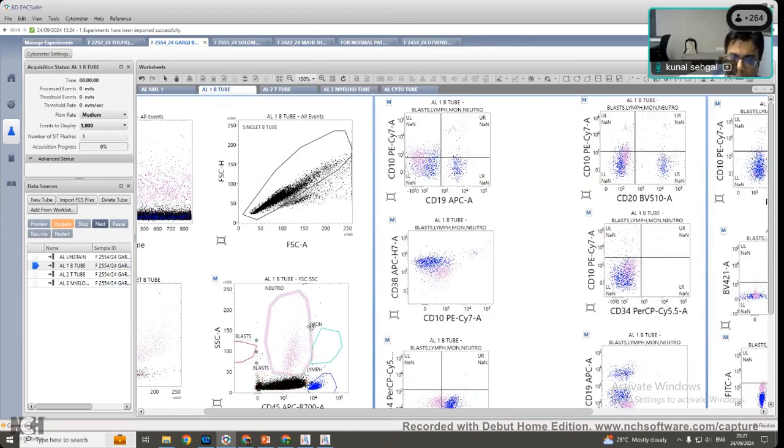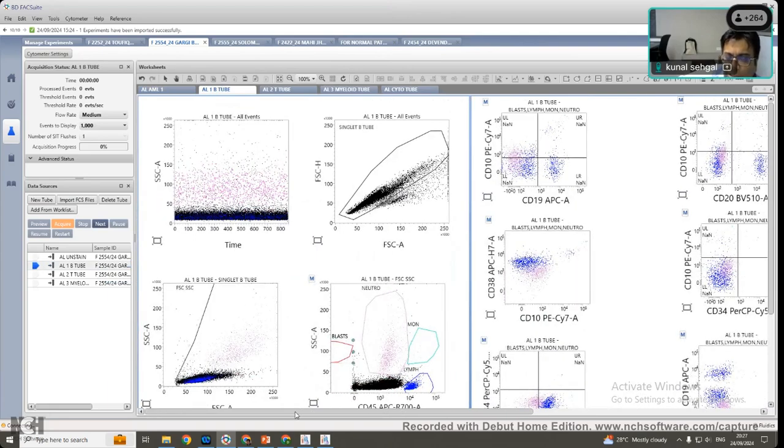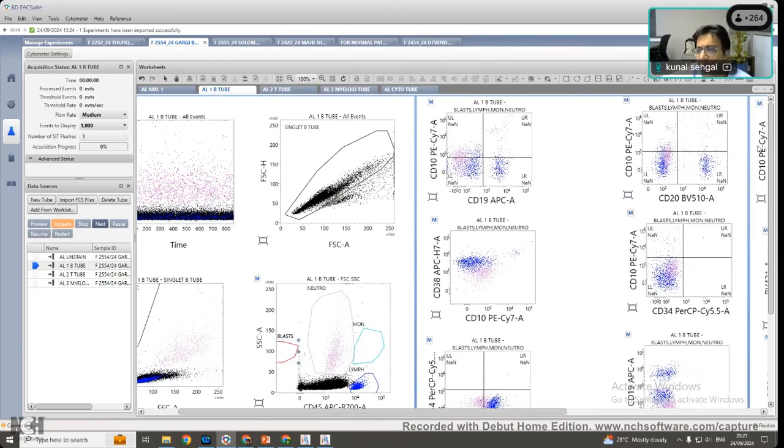It is very challenging. Okay, so in a child, if there are very large blasts which go with the leukemia panel, sometimes you have to use both the panels. So that is one point. Anyways, in this case, we had a lot of blasts and we ran a panel. But I wanted to focus on normals first. Okay, Avinash, you can tell one of the students to answer. What is this blue color population? Yeah, Bimbit.